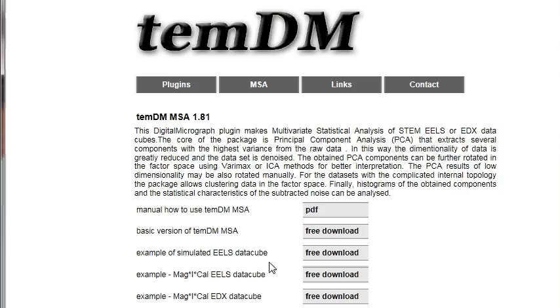Also, I would recommend you download an example of a simulated EELS datacube. That simple example will help you learn the new package quickly and most efficiently.